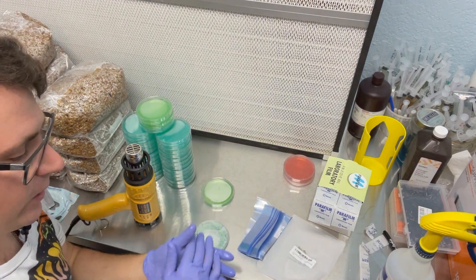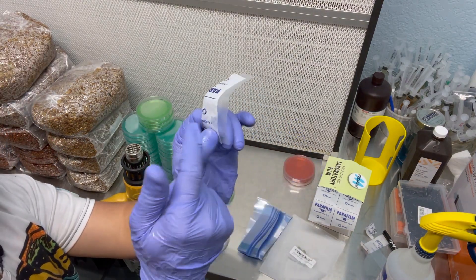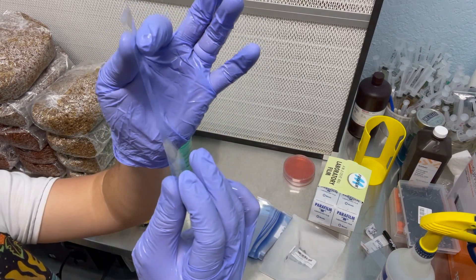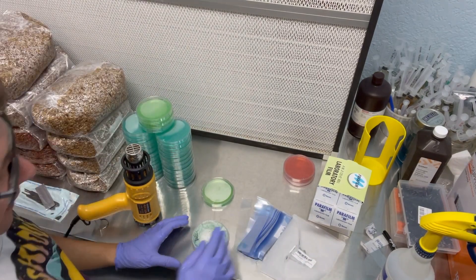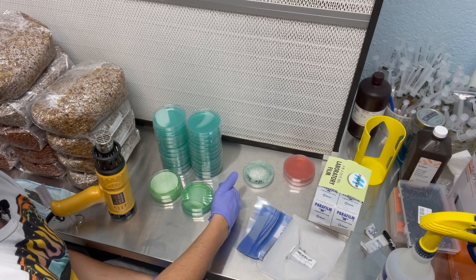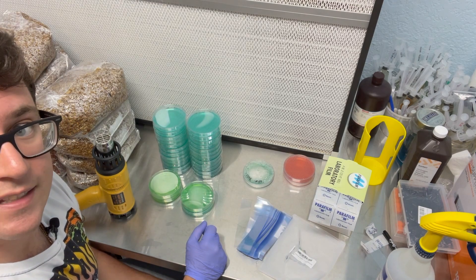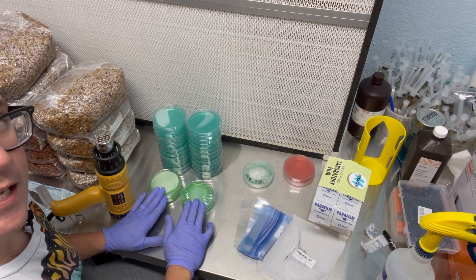Neither of these are completely sterile, but I always try to work with the inside piece of the parafilm that's against the plastic — to me that's a little more sterile than the outside part that comes off the roll. For the shrink wrap strips, the inside should be generally sterile too, so I feel like there's a pretty similar comparison between parafilm and shrink wrap as far as sterility goes. I'll do a whole rack in parafilm and a whole rack shrink wrapped, then leave them in front of the flow hood for a few days and see if one is drying out or showing more condensation.